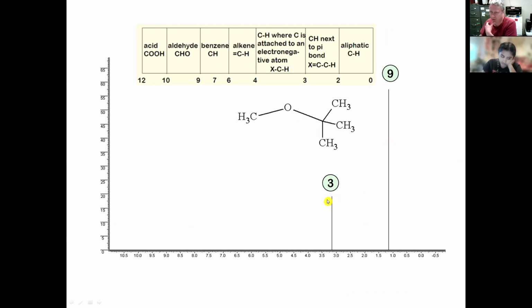But look, does the integration make sense? 3 to 9? That should make sense to you, right? Of course. That's the CH3, it's 3. That's 3 CH3s, that's 9. Yeah, that makes sense, right? What about the chemical shifts? Do they make sense to you?